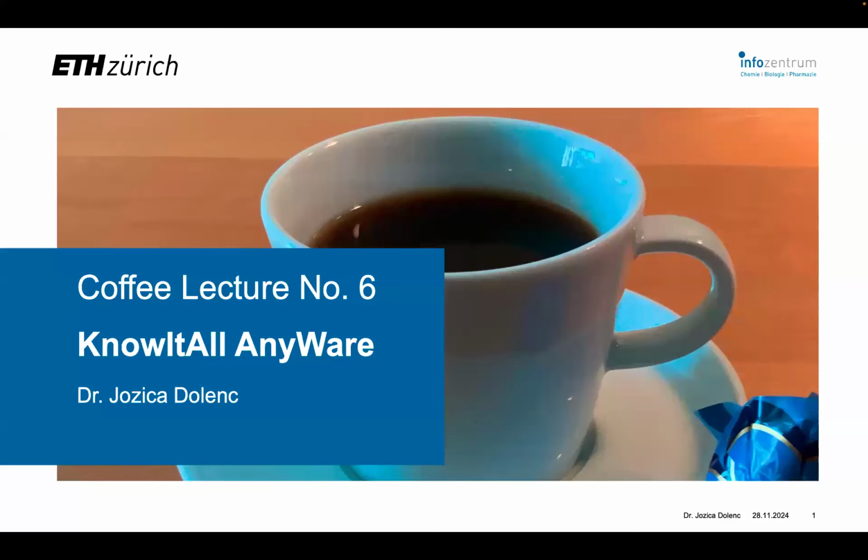All right, so welcome to coffee lecture number 6 from this series. It's one of the earliest coffee lectures, which we started giving back in 2013: KnowItAll AnyWare, software and database for spectra. And we repeat it regularly because we realize very often the knowledge gets lost that we are actually licensing this source.